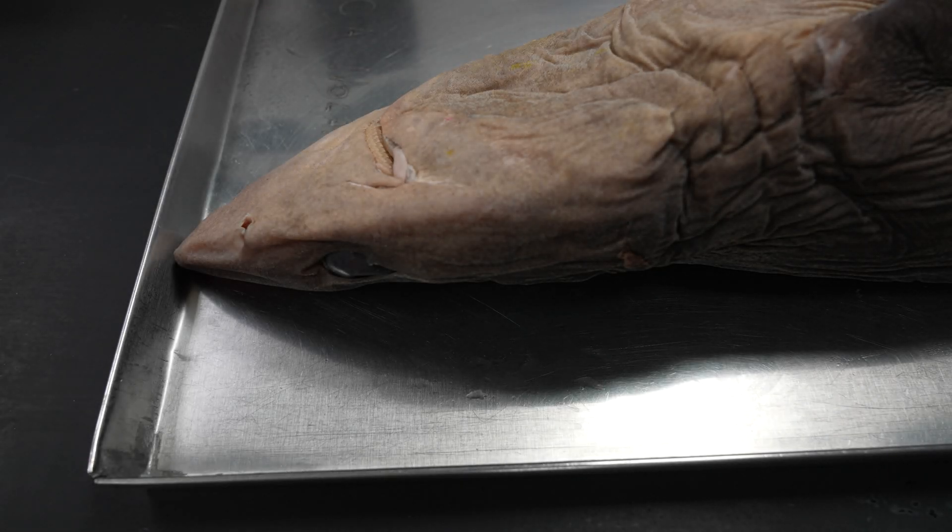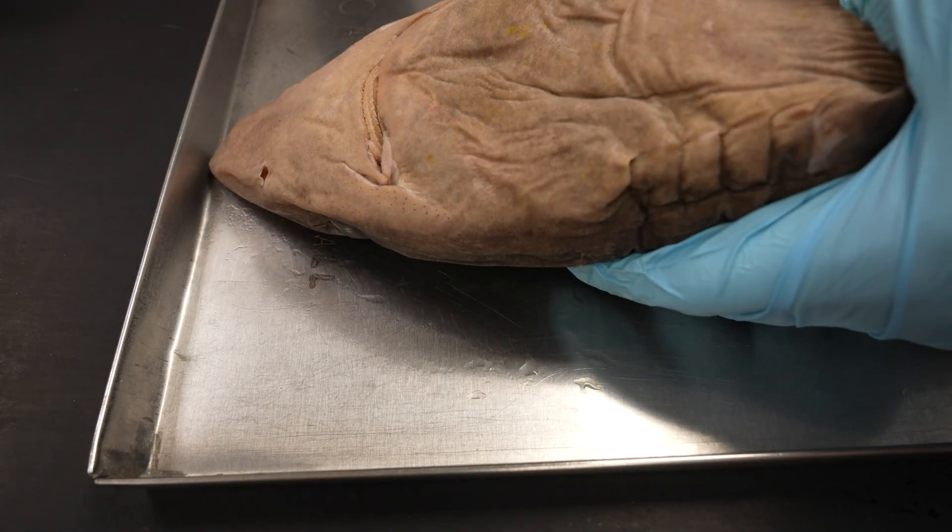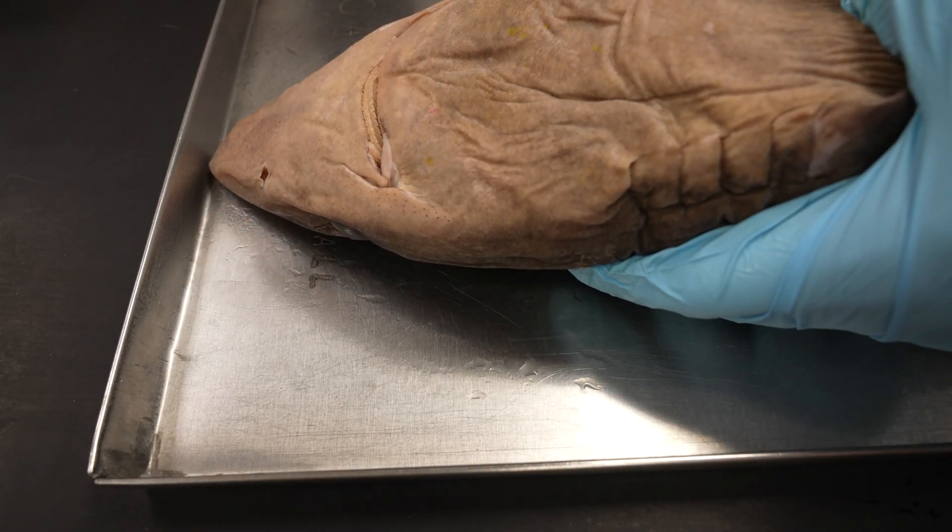Hi everyone. Today we're going to go over the shark muscle dissection. You can check out the walkthrough video on the YouTube channel.